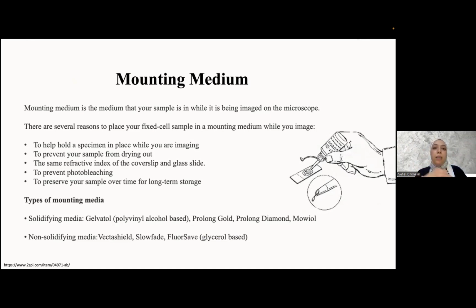So we have to avoid photobleaching of the fluorophore signal, avoid shrinkage or drying of our samples, and keep them for the long term, weeks or even months. With time, photobleaching will happen for sure, but it can be kept for a long time. I kept them for months, and it was okay.